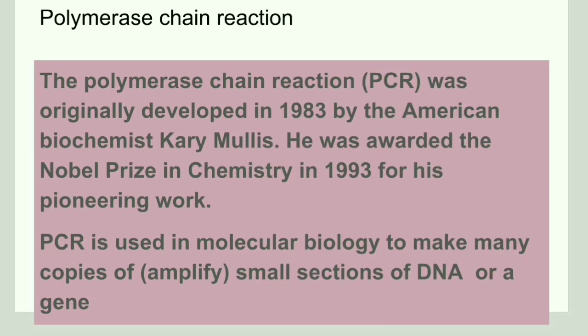So today, we will learn about polymerase chain reaction. Polymerase chain reaction is often known as PCR. This has been developed by Mullis, and for this, he was awarded the Nobel Prize in Chemistry.